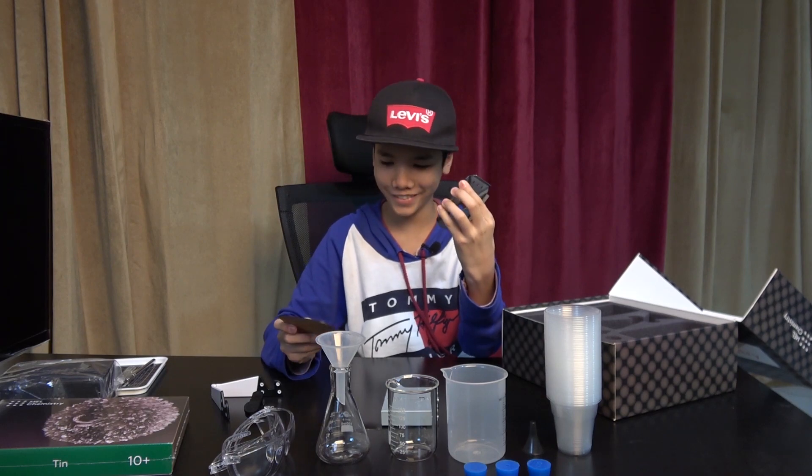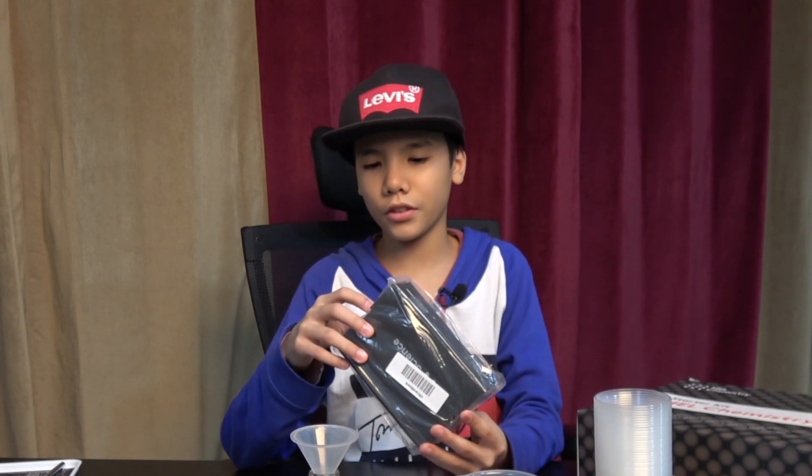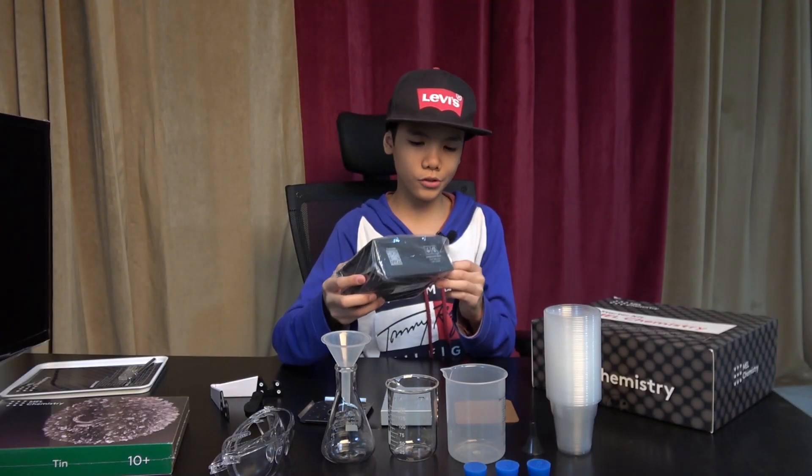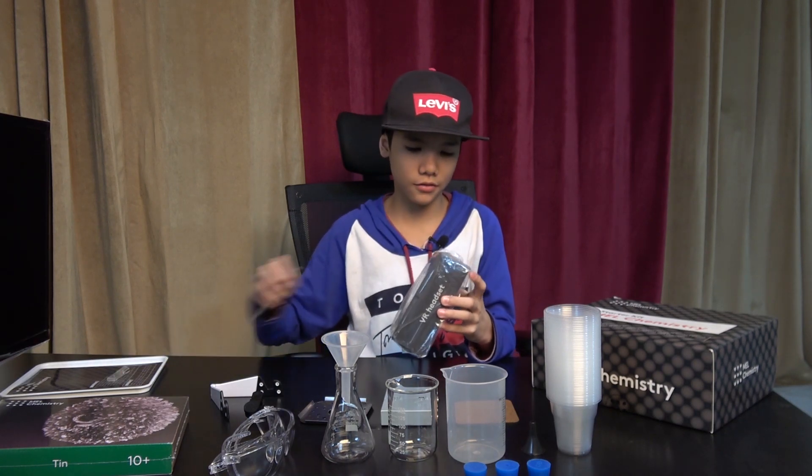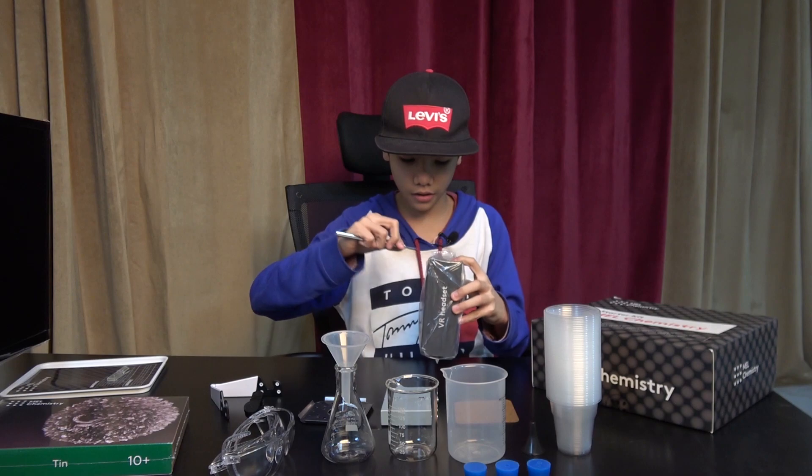This is the cork hot pot stand and the flame diffuser. That covers everything inside the starter kit. For the last part of this video we are going to open the VR cardboard headset.